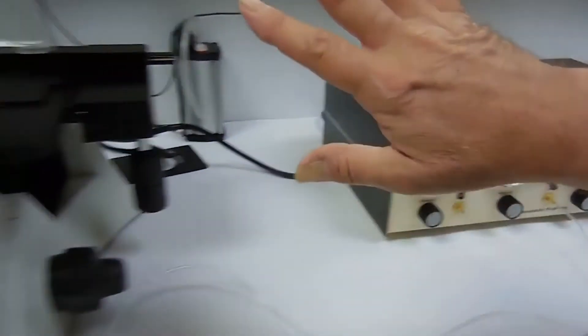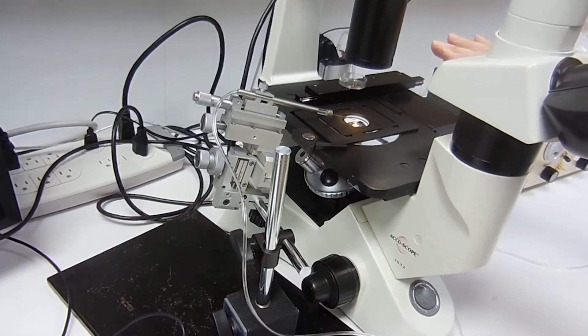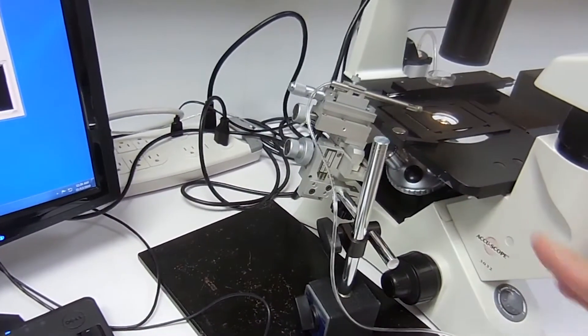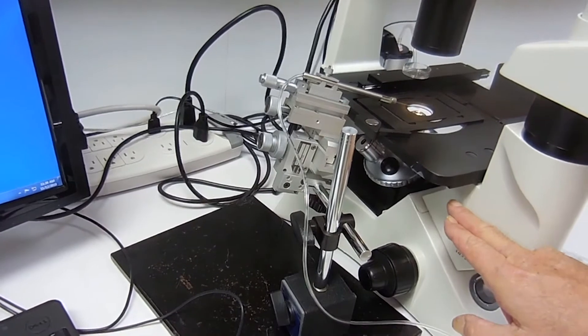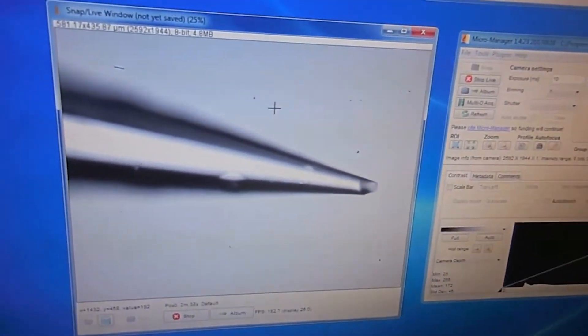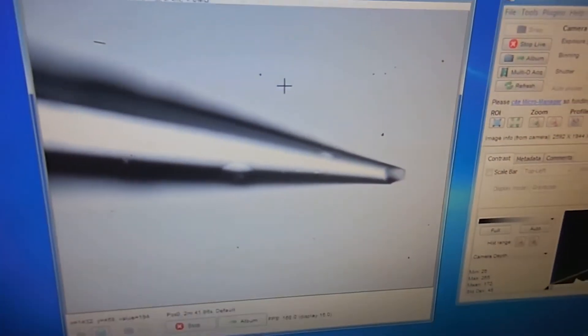Over here on the microscope we have the Pica nozzle set up with a 2 micron tip with distilled water in it and it's basically being held. We're focusing on it with a 20x microscope objective and then we'll go over to the monitor over here and you'll actually see the very tip of the micropipette in focus.